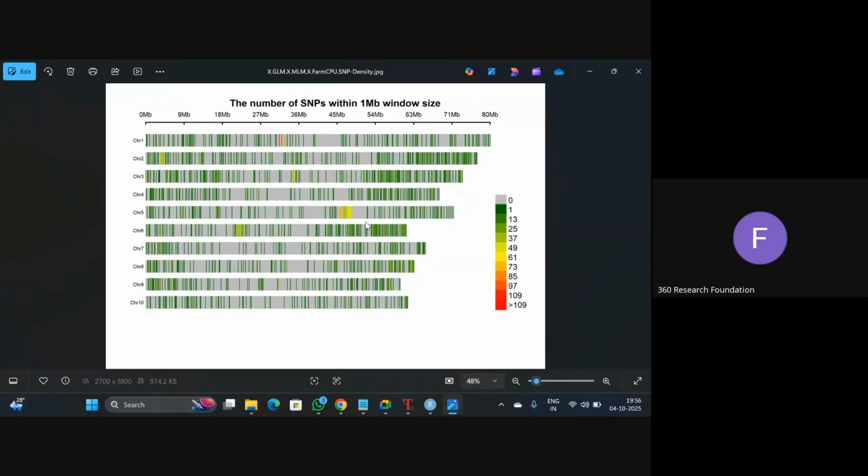Whatever genotypic data you have, say the HapMap file you have for 10 chromosomes with 3042 markers, this representation just shows, across the chromosomes, at which places what the distribution of your SNP markers is, the distribution of your 3000 markers. Okay, sir.